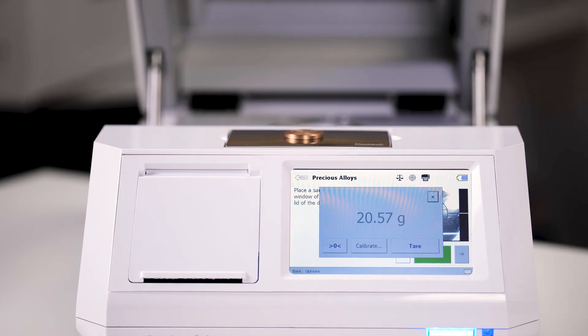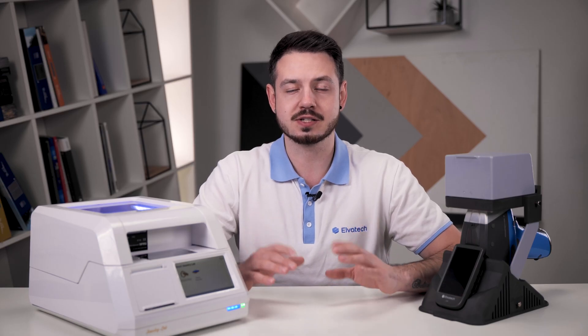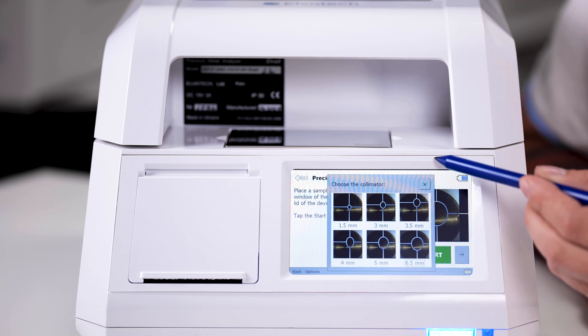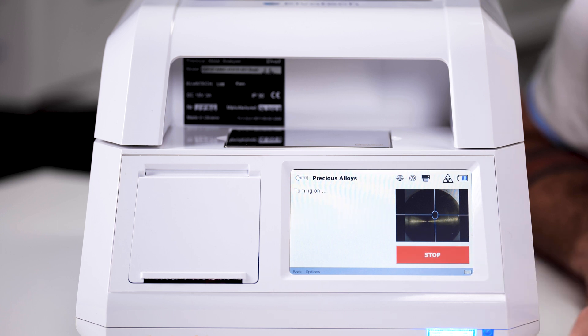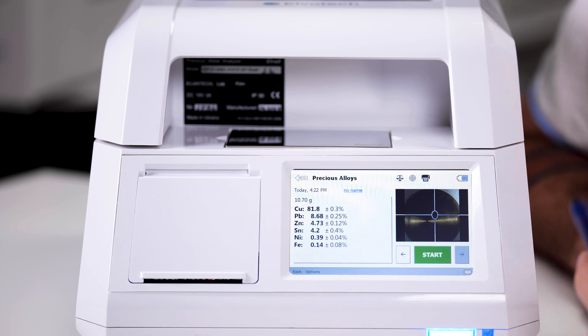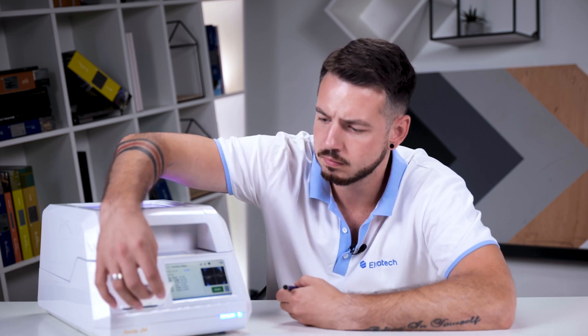Now that the calibration is selected, we can weigh our sample on the built-in precision scales — as you can see, the weighing was quick and accurate. Now let's move to the analysis itself. After selecting the collimator we need, we press the start button. The analysis only takes a few seconds, and here are the results — shown in both percentage and carats, along with other details that you can print out. Finally, let's print all the data using the built-in printer. We now have a complete analytical certificate that can be given to the client or saved for the archive.